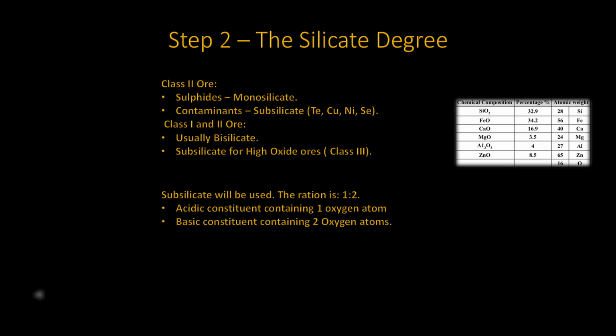The silica is the acid portion, and the base metals and flux constituents are the base elements of the charge. The representation here is that 1 part silica is fused with 2 parts of base material. This series of calculations will be shown, as it is step 5 in the charge table.